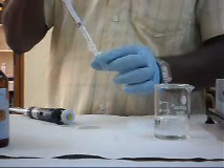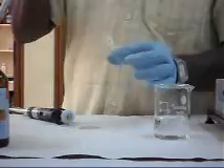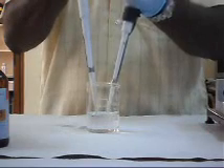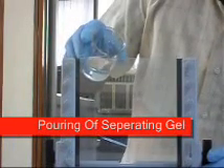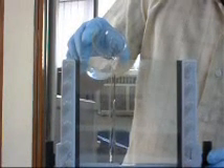The polymerization is initiated by adding 10% APS to the mix, followed by TEMED. Cross-linked polyacrylamide gels are formed from the polymerization of the acrylamide monomer in the presence of a small amount of bisacrylamide. The separating gel is then poured.